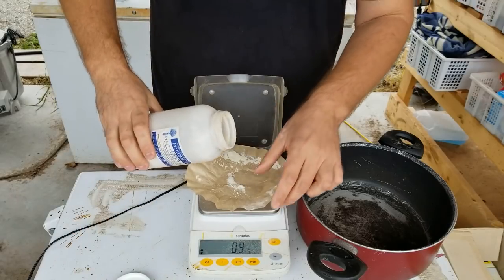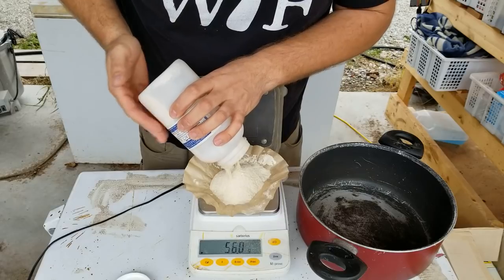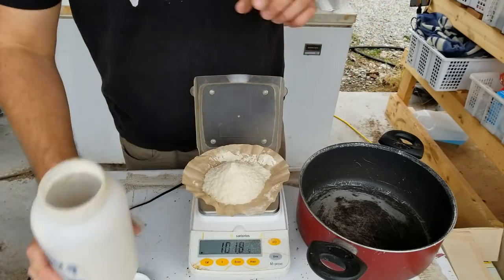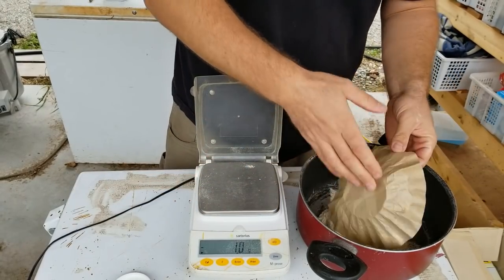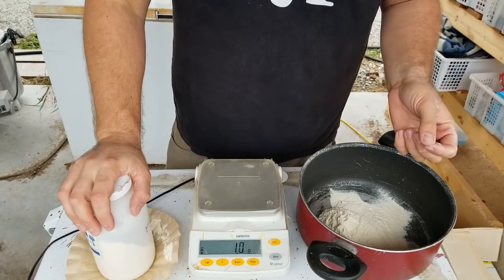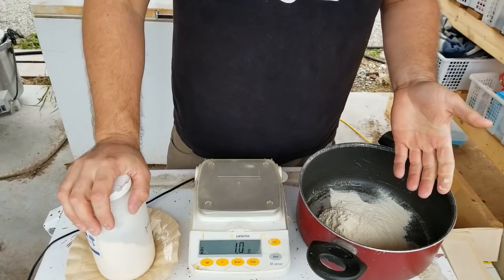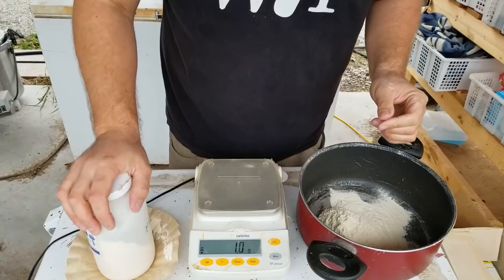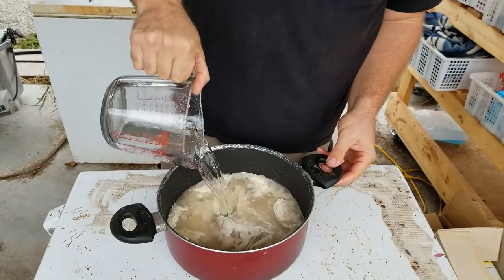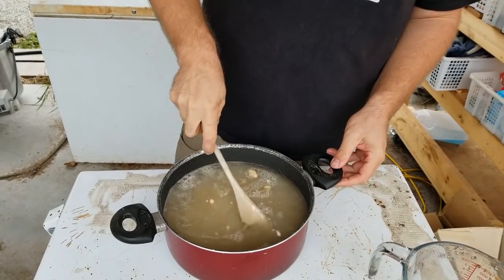Next we're going to take our MEA and measure 100 grams to do 80 plates, mixed with two liters of water. The standard recipe for malt extract agar is 50 grams per liter for 40 plates. I like to do a bunch of plates at a time because it's about a six to seven hour process from start to finish. You need to account for water loss from heating, plus agar sticking to the pot and bottles. For this reason I'm going to add 2.6 liters of water to 100 grams of MEA to offset any evaporation and any agar that sticks to the pot or the whiskey bottles.